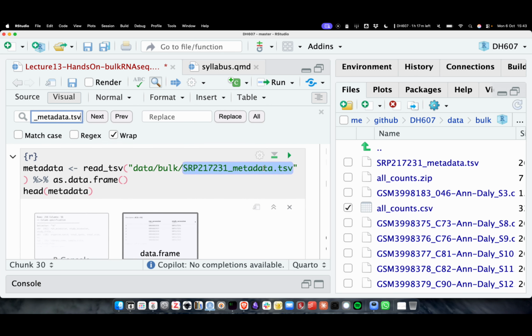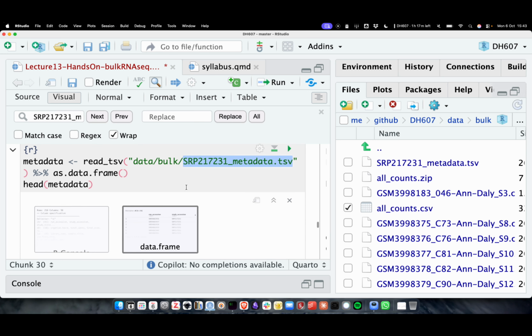Everyone has a metadata file now. If not, if you don't have it, Aman? You have it? Okay. Anyone who's having trouble getting the metadata file? I can upload it, but since you're going to do projects, it's time to level up. I'm not doing anything pristine, I'm not doing anything novel. Literally copy pasted a line from there.